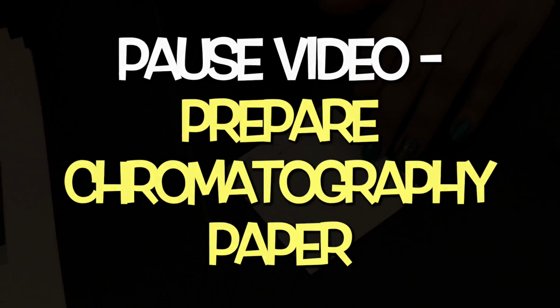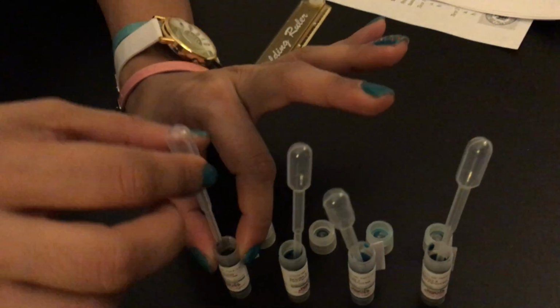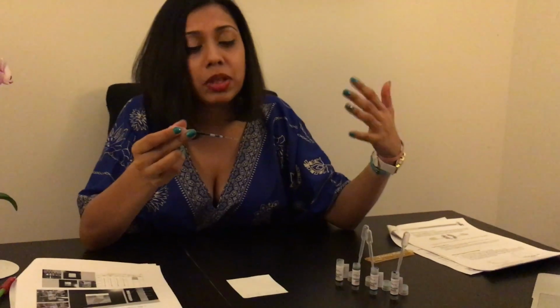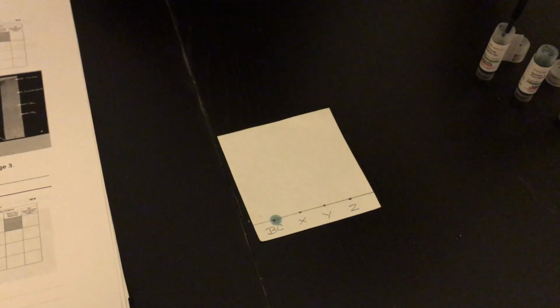And when I am ready, I'm going to use, of course, a different pipette for each one so the pigments don't get mixed up. A little bit of background. These pigments are taken from each of the plant species, and we are comparing these pigments to find which plant species may be the most closely related. So Botanicurus pigment, 1 drop right over here. Not too much because I don't want it to spread too much in the paper.